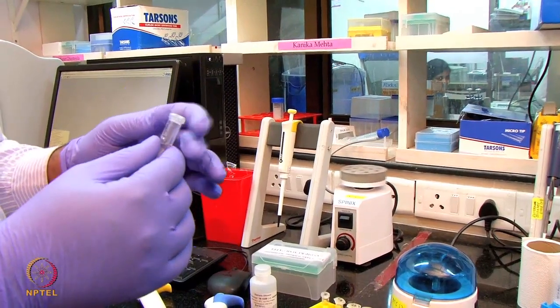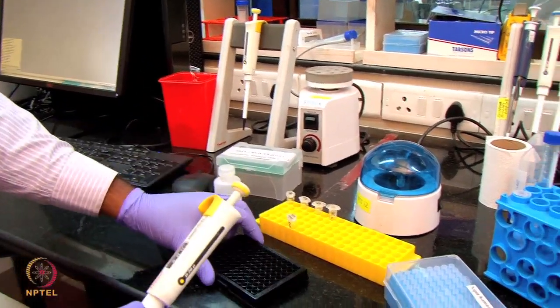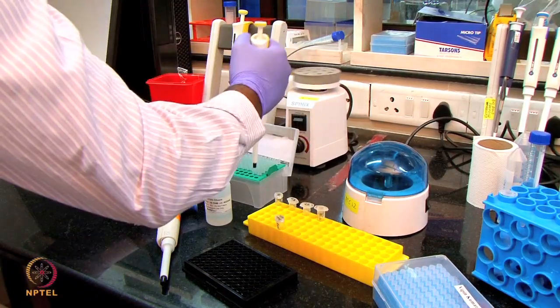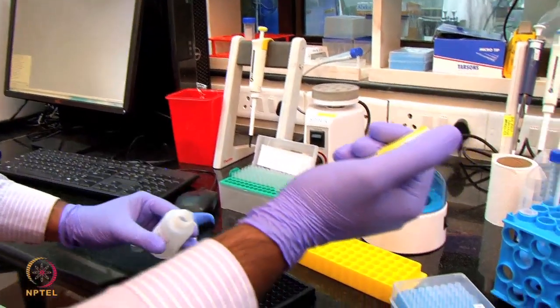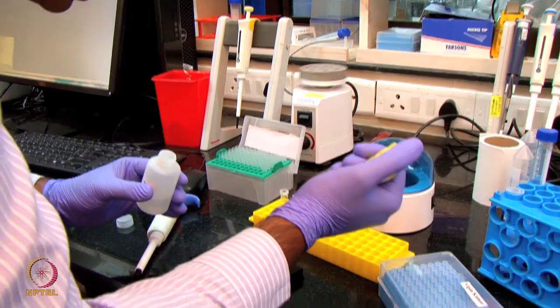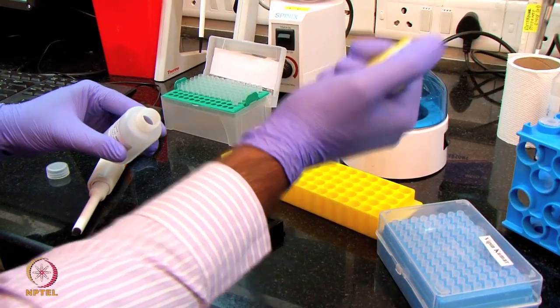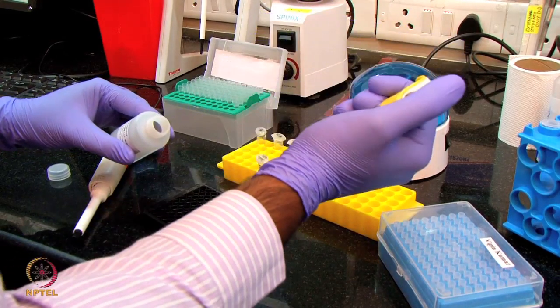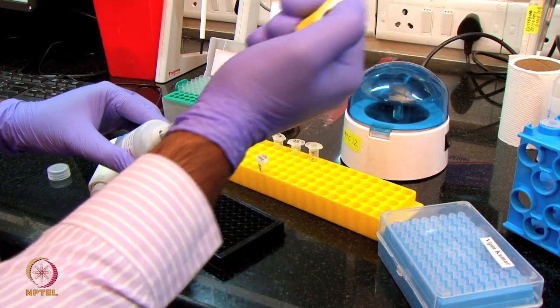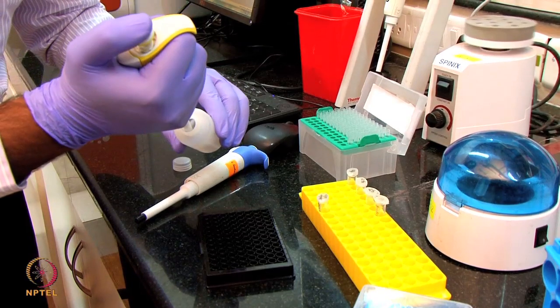From this, I'm going to do a serial two-fold dilution with the buffer. Prior to that, I'm taking this 96 well plate and adding the buffer into the wells. I'm going to use around 6 concentrations with 2-fold dilutions, and I'm going to do the dilution in the plate itself. So I'm placing 200 microliter each of the sample diluent buffer in 6 wells of the 96 well plate. I'm going to use 3 wells of plain buffer as references.